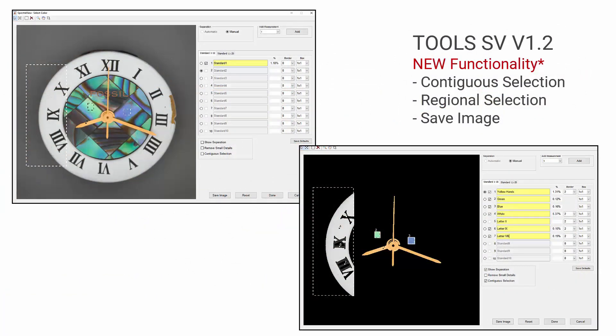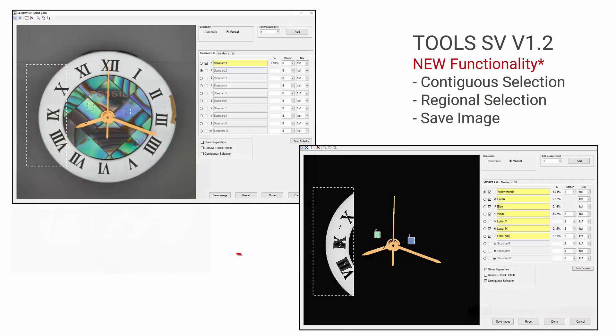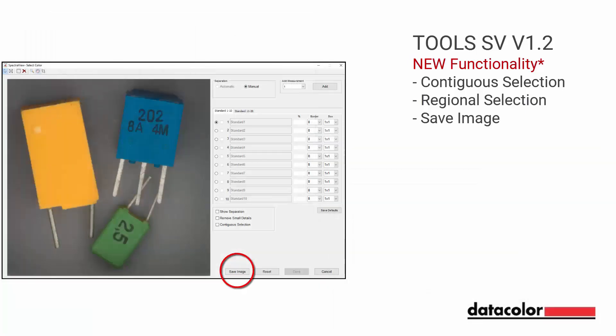Tools SV version 1.2 enables the user with the ability to save entire images or a portion of the image captured during sample measurement.